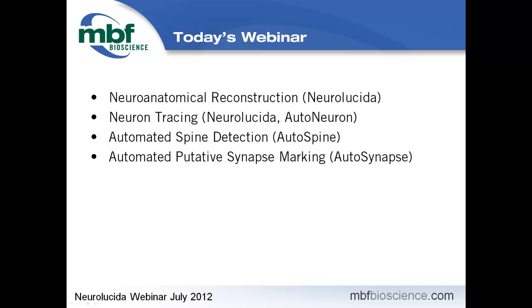Our webinar will follow a similar progression. We'll show how to use Neuralucida for neuroanatomical reconstruction — putting in the anatomical regions around the neuron — then zoom up to look at neuron tracing. We'll then go to even higher magnification for automated spine detection, and finally look at how to detect particles that could be putative synapses near processes.